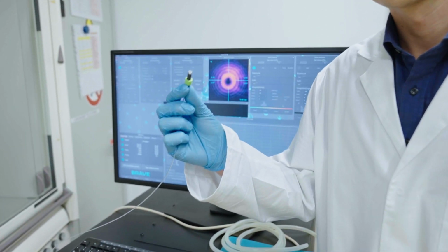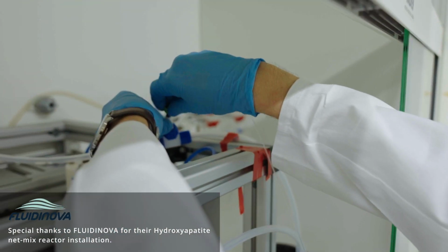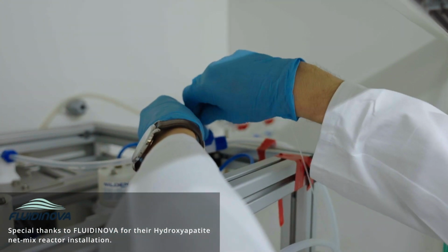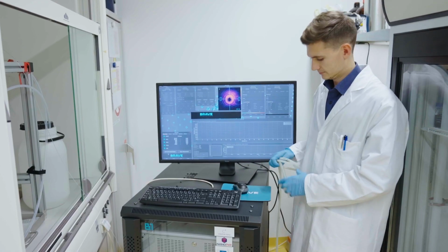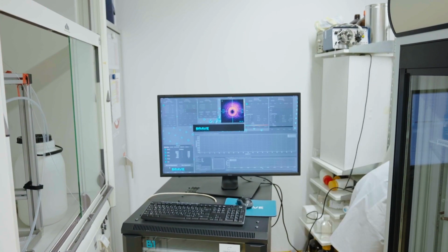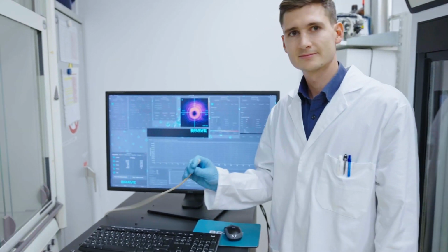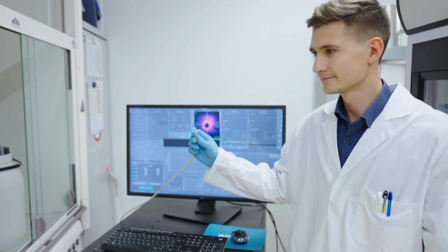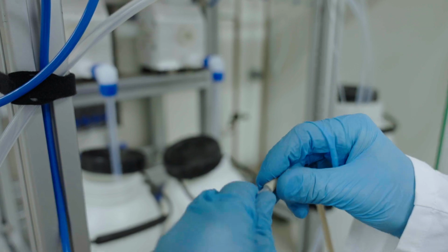Basically, for every installation, these steps must be taken. Decide on the sample withdrawal point within your production process for the bypass connection. In this case, we measure right after the particle synthesis at this particle reactor. For the sample outlet, connect the waste connection or recollect the sample again if wanted for further analysis. If needed, connect the dilution media to your Brave B-Continuous device for automatic sample preparation. Make sure all connections are tight.